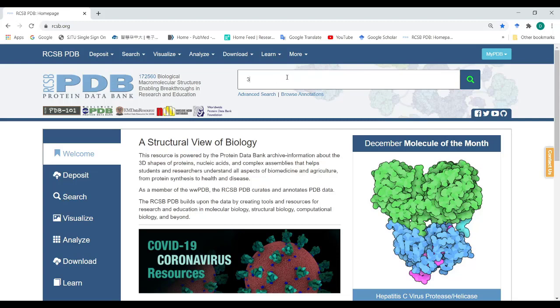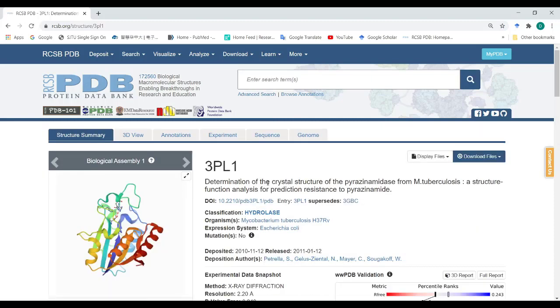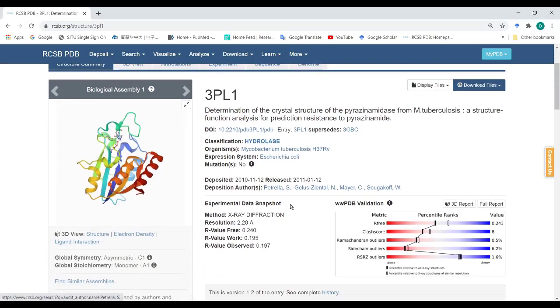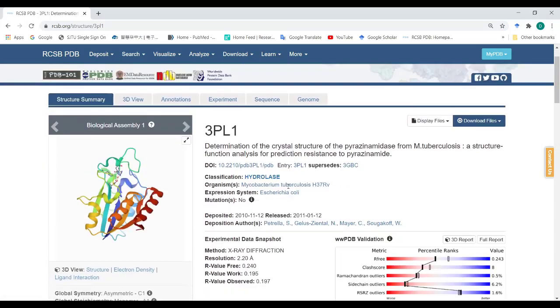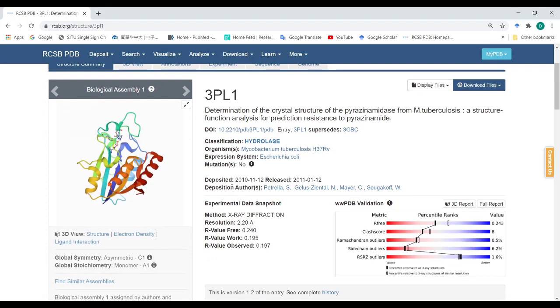The protein I am going to download has the code 3PL1. Click on search. This is the whole information about the protein. The classification of this protein is hydrolase. It is purified from Mycobacterium tuberculosis and expressed in E. coli.